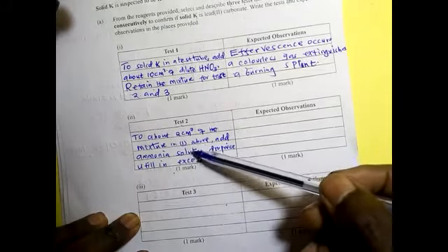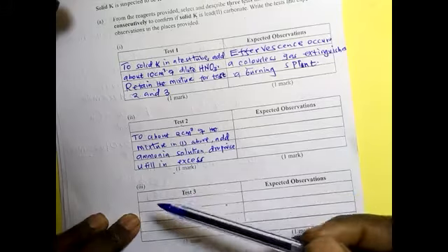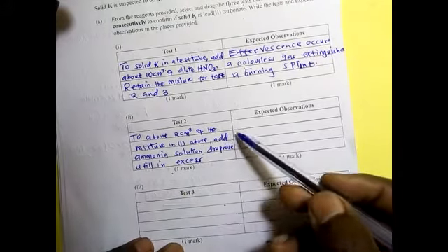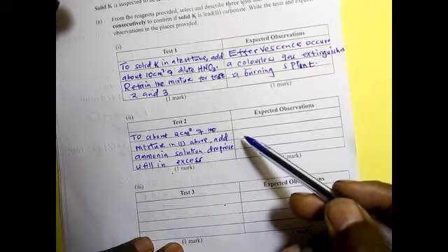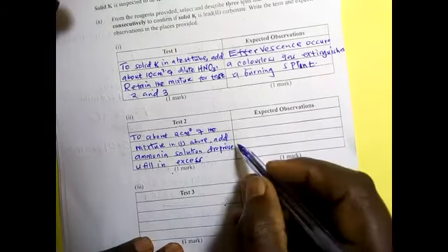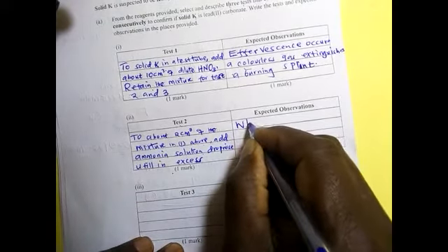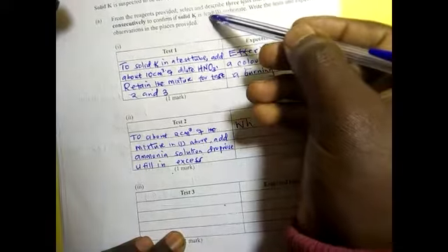But if it does not dissolve, then there are other ions inside, like aluminium. So here, the observation is a white precipitate, because we are suspecting lead.